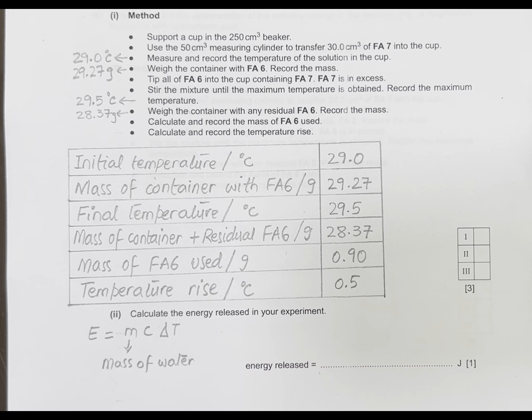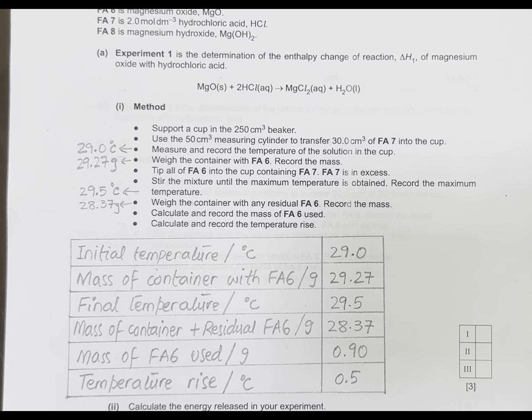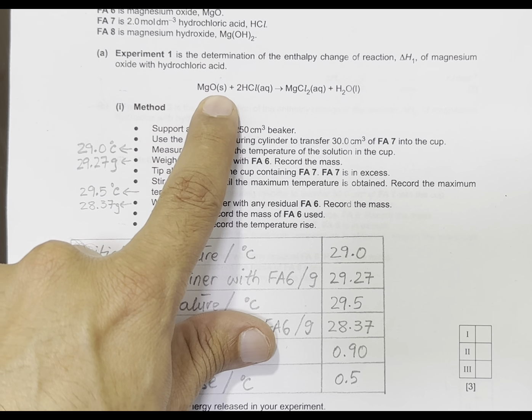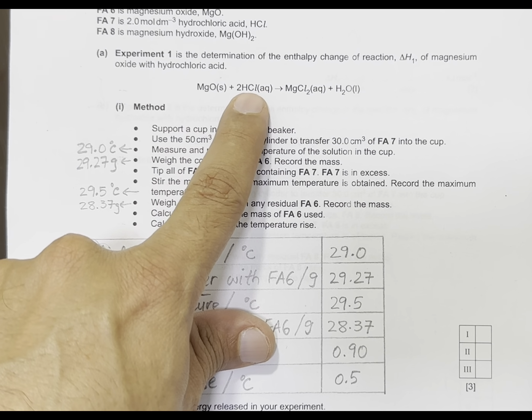Here, the only solution or aqueous phase we used was HCl. If you look at the equation, magnesium oxide solid is reacting with aqueous hydrochloric acid. So the aqueous phase is just HCl, which is FA7, taken as 30 cm³.